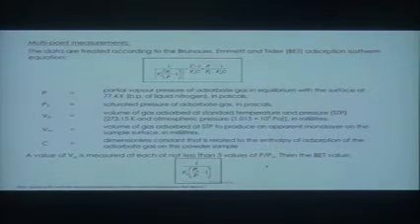You measure basically the pressure in your chamber as you're cooling it down, or you're pumping it down, and you'll know how much nitrogen you put in, and how much pressure you should have if, for example, it did not adsorb on a surface, because the adsorbed species does not contribute to pressure. So that's the general idea.